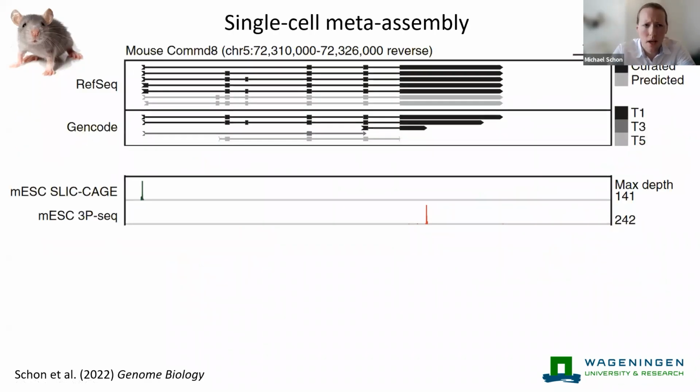So here I'm just illustrating at a single gene what it looks like to be as precise as possible in performing hybrid assembly.